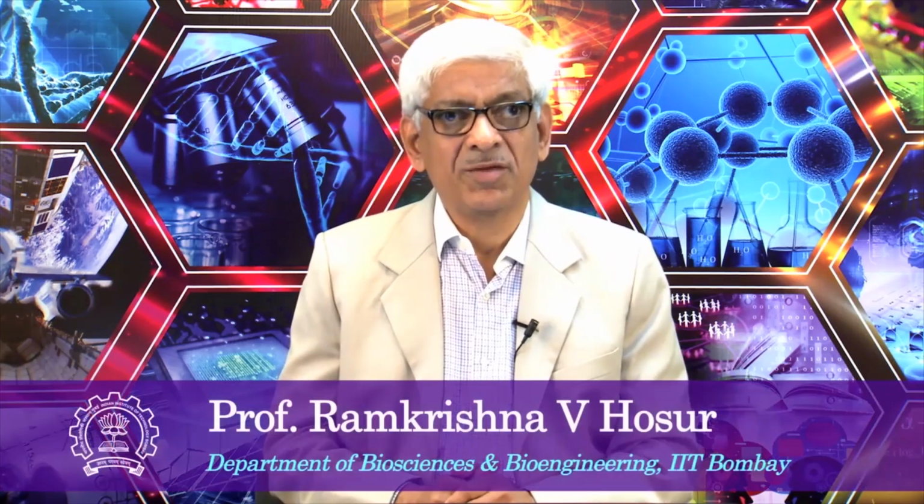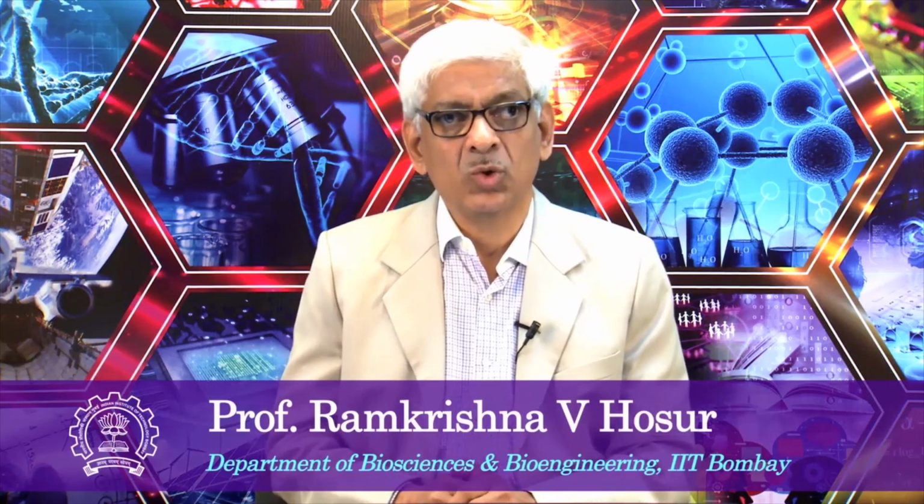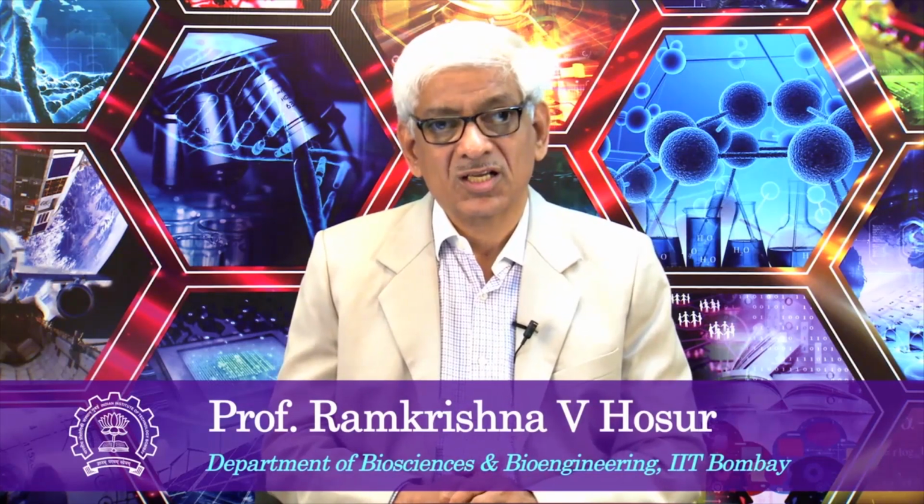So, in the previous classes we have discussed in detail the product operator formalism for describing density operator evolution through an NMR experiment, and we have seen how it becomes easier to use this formalism for analyzing NMR experiments. Explicitly we considered the spin echo in the previous classes, and I am going to extend this further, describe to you one more experiment as an example, and that is the INEPT.